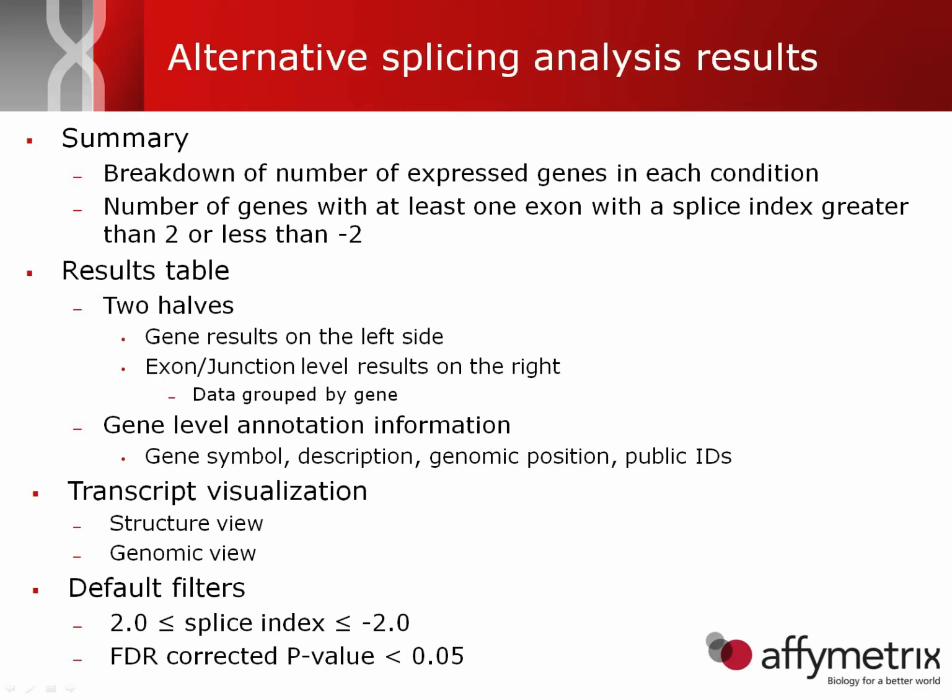In addition, there's gene level annotation information provided, including gene symbol, position, and a short description. Then there's also the transcript visualization piece, in which the exons and junction probes are visualized and are color-coded based on their expression or their splice index.